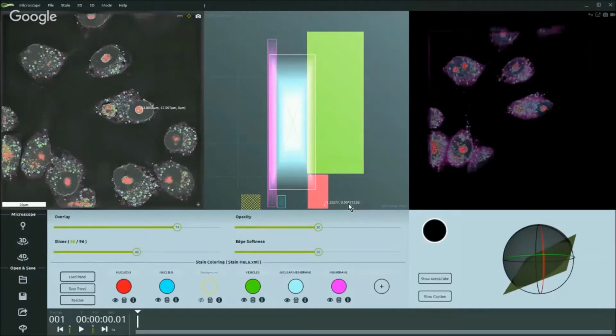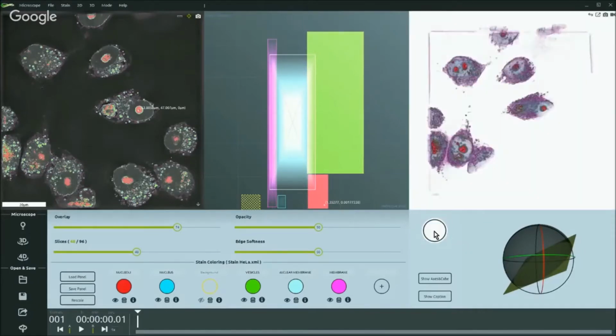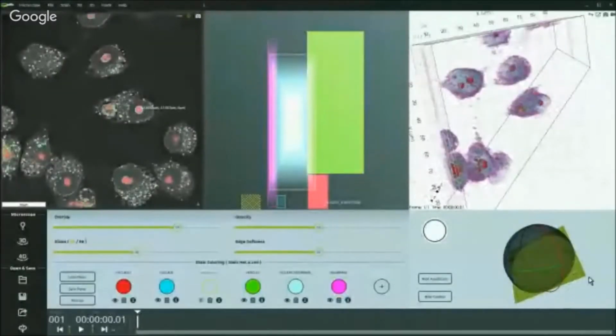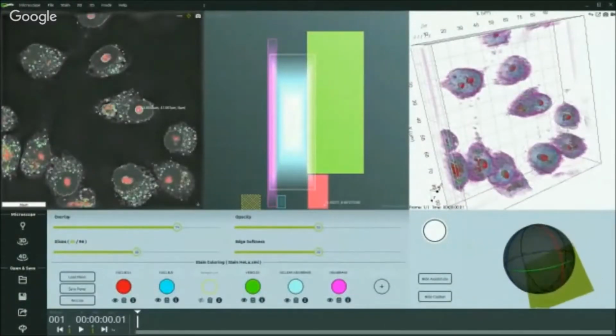Then we have some other questions that popped out. Another question is, what is the XYZ field of view and is it fixed? Okay, so the XYZ field of view is 80 micrometer in X and Y and 30 micrometer in Z. You can actually see it better here. Let me remove, sorry, the cutting. And voila.